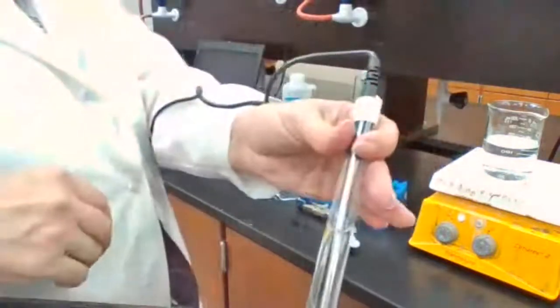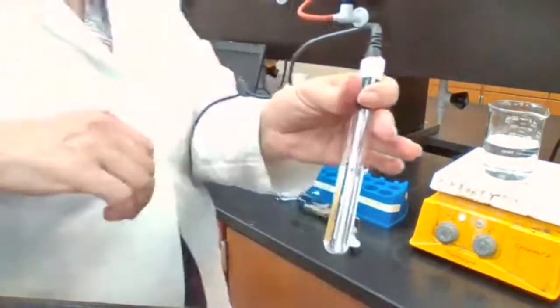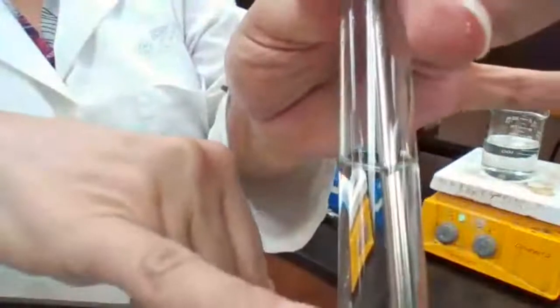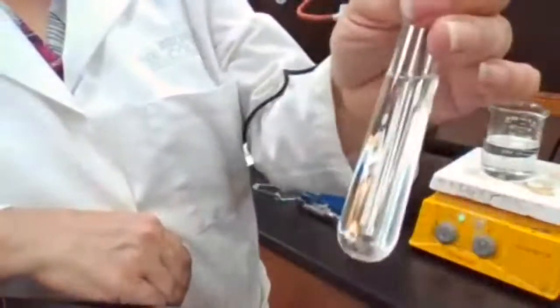Okay, 81, I'm sorry, 83.4. Look at the crystals coming out. Do you see the flakes? 83.4, very good, yes. They look just like flakes coming down.